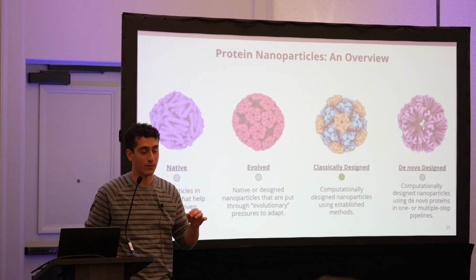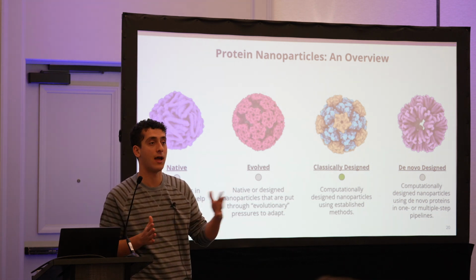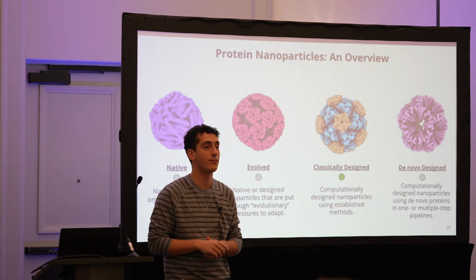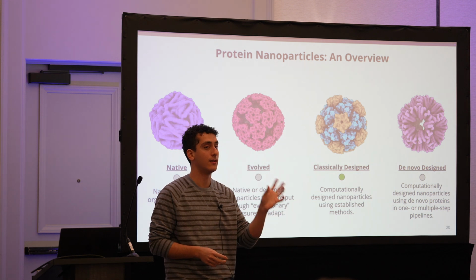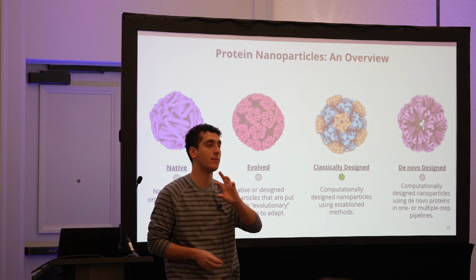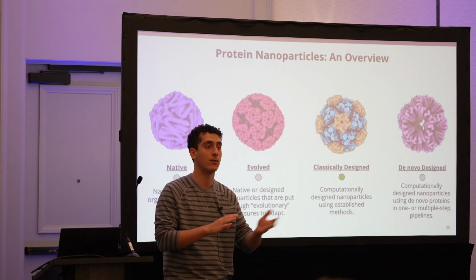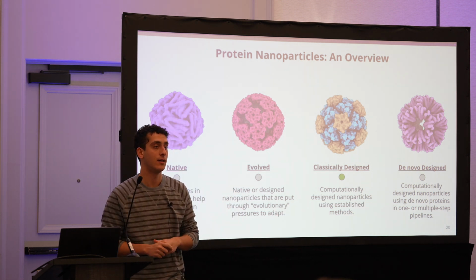It's hard to get when you just produce one out of E. coli. If you're going to get a raw SEC curve from that, you'll see there's usually a couple other populations. There's typically an aggregation peak, and there's typically a component peak, so some of your components are not actually going to form the nanoparticle. And so there is a little bit of off-target assemblies.